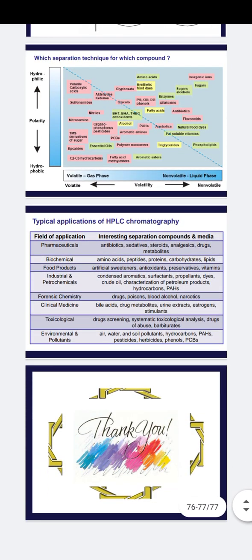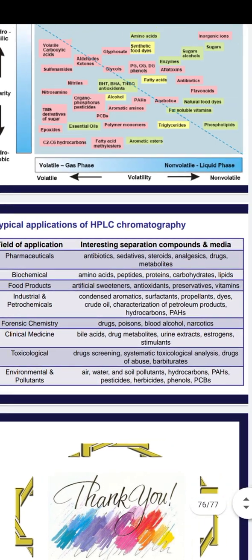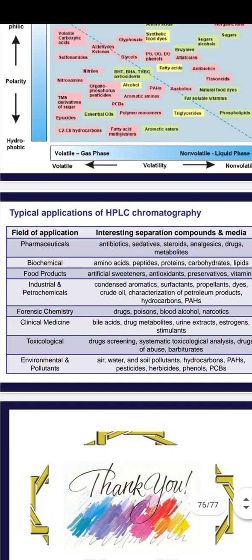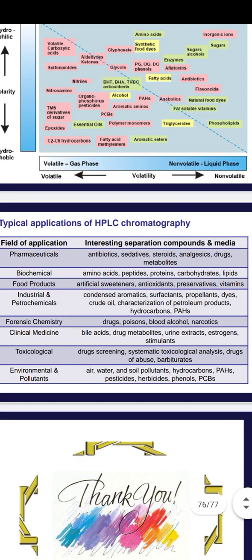And applications of HPLC. The field of application in pharmaceuticals: we use it to separate components like antibiotics, sedatives, steroids, analgesics, drugs and metabolites. In biochemicals: amino acids, peptides, proteins, carbohydrates, lipids. In food products: artificial sweeteners, antioxidants, preservatives and vitamins.